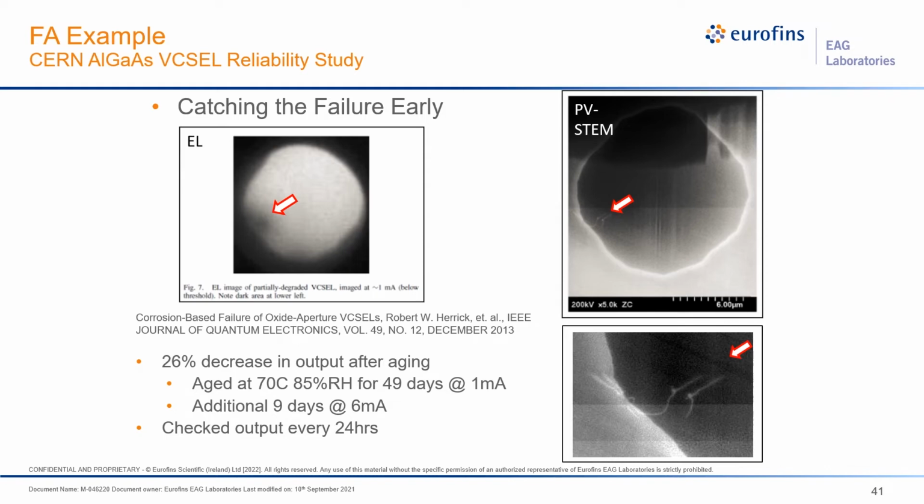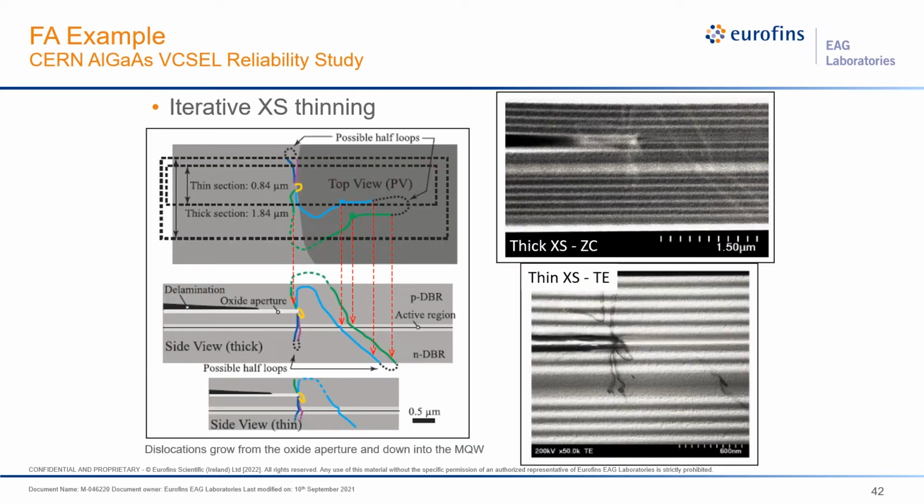for example, electroluminescence, to find the hotspot of the failure site. With this, we label the failure site, then we cut through the region and find a defect. So a lot of times for a real engineering device, we do fault isolation as a first step.